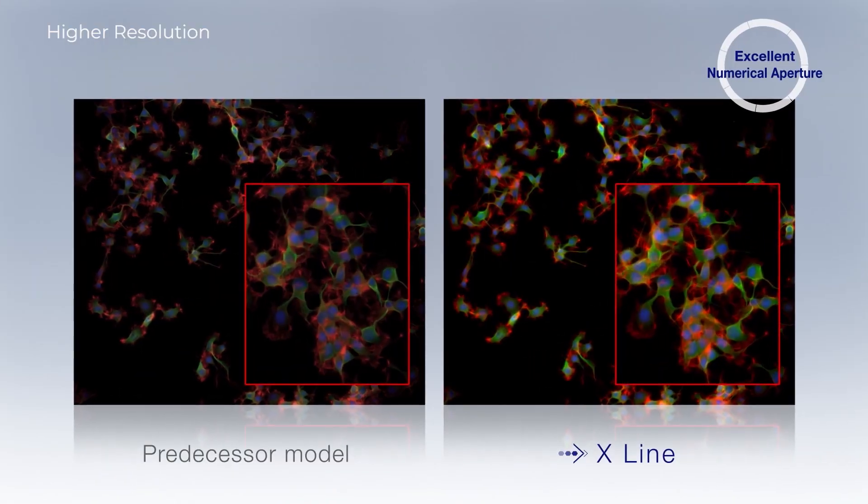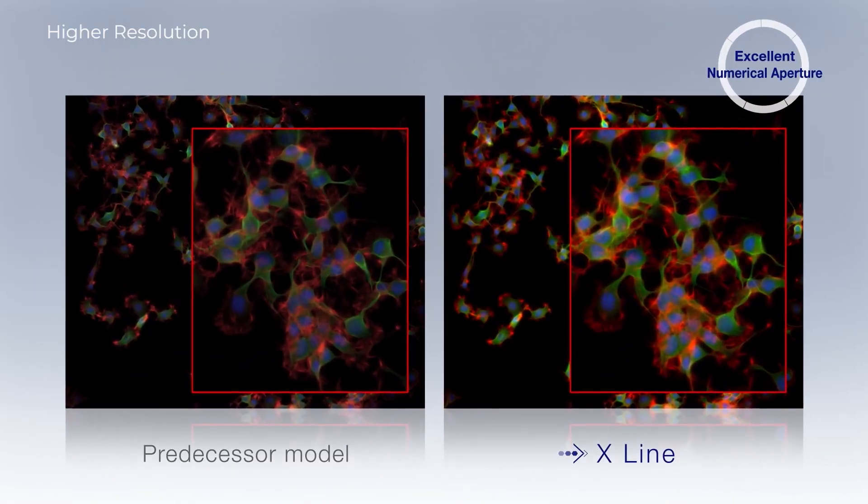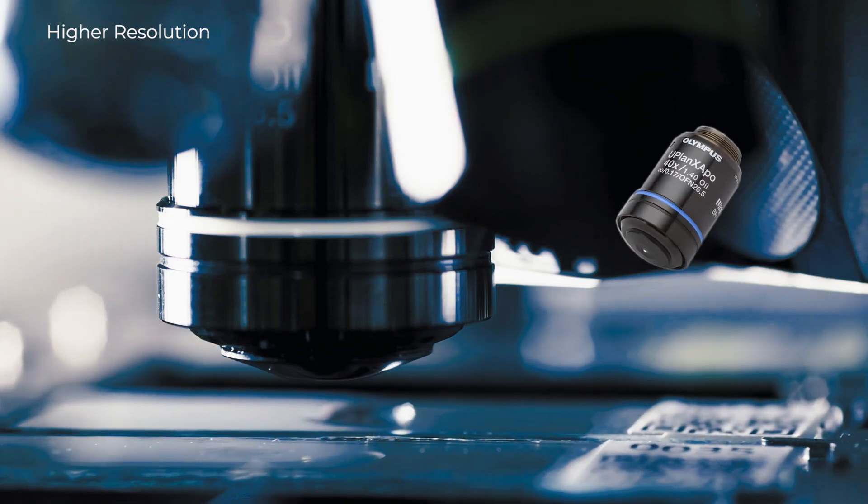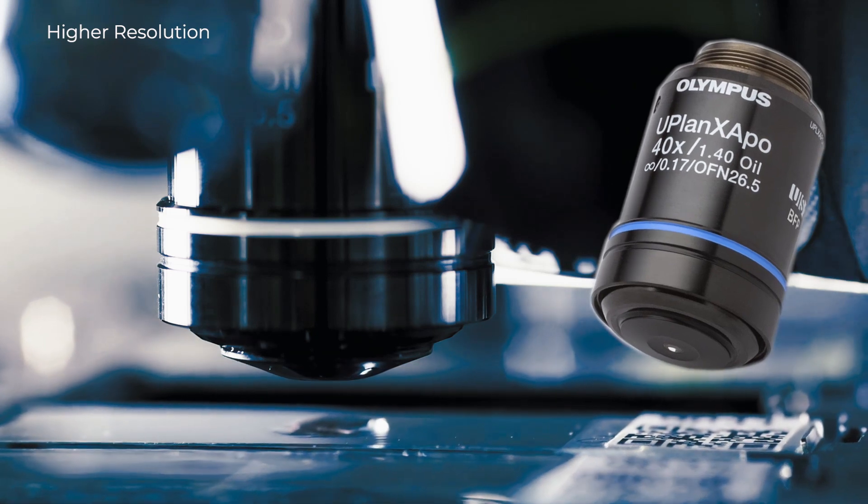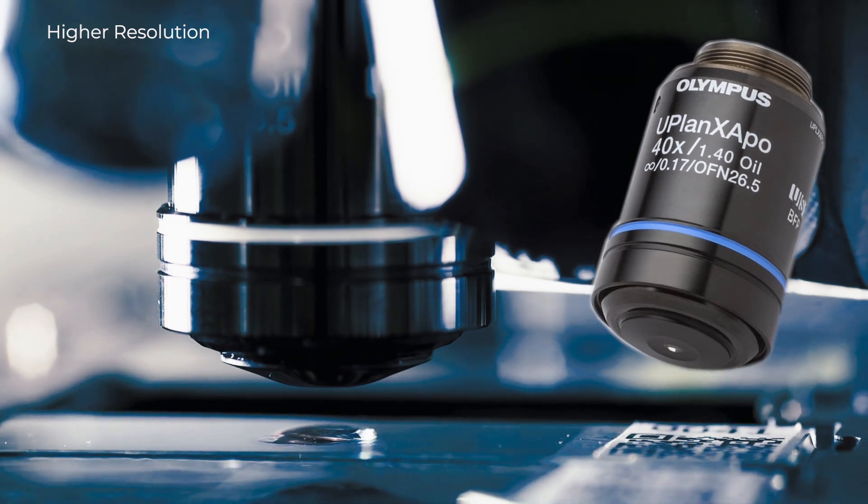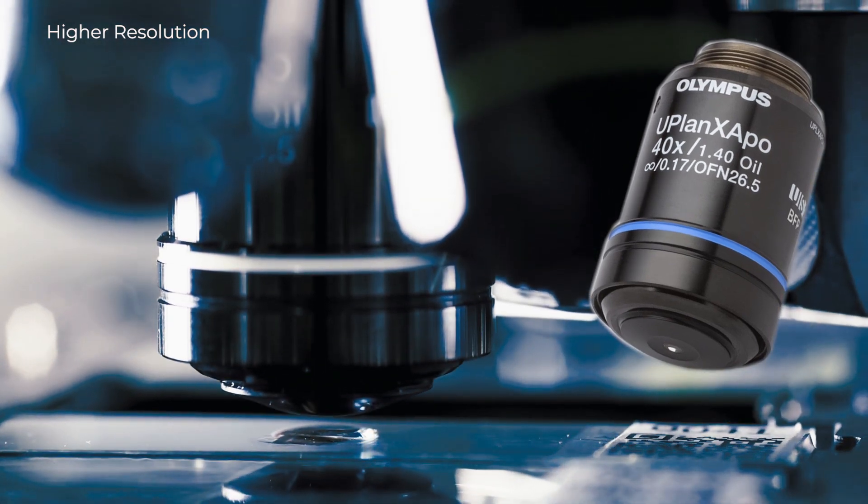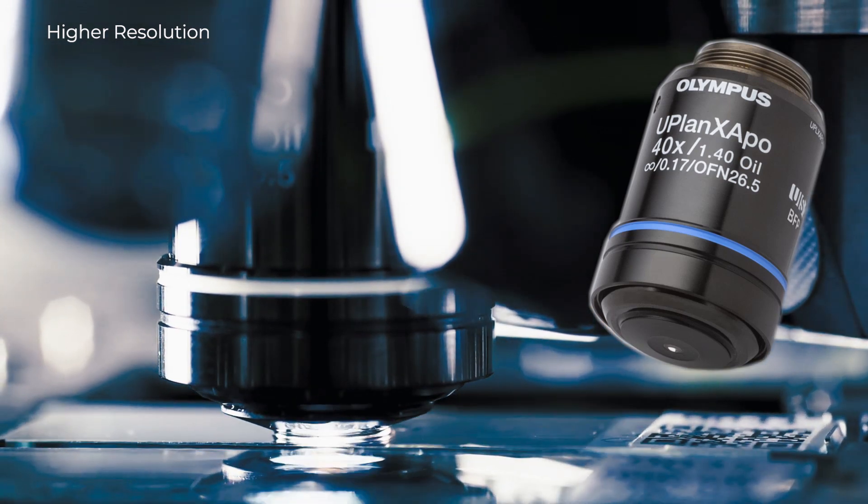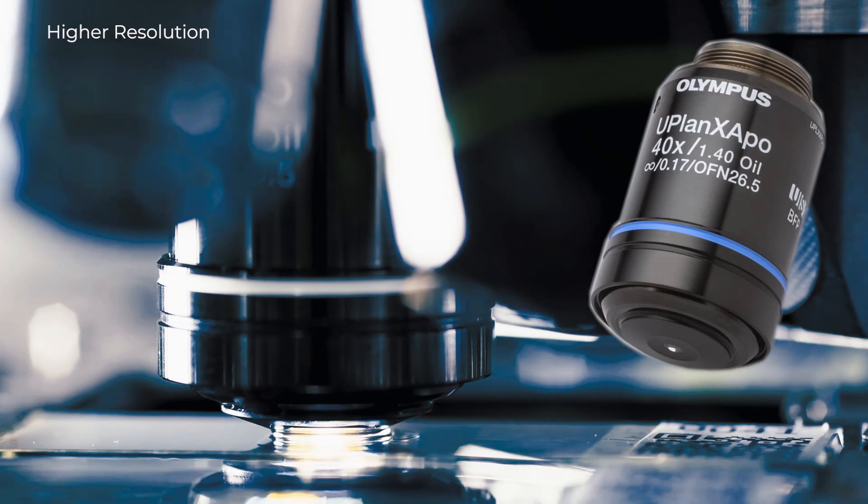Objectives with a larger numerical aperture gather a wider range of light, resulting in brighter, higher resolution images. Our 40X OIL X-Line objective features a numerical aperture of 1.4, equivalent to 60X and 100X offerings for the same image quality over a wider field of view, which can be less damaging for samples.